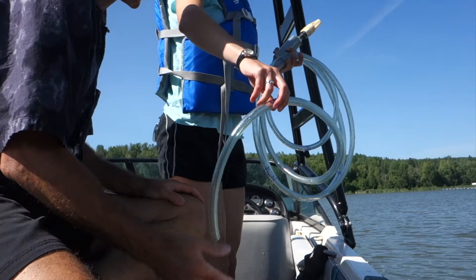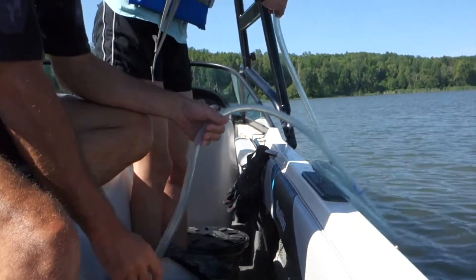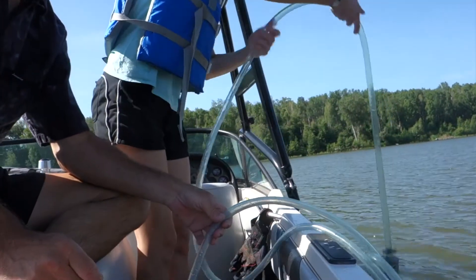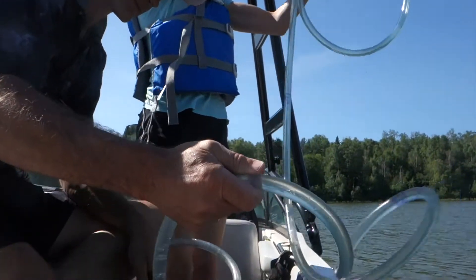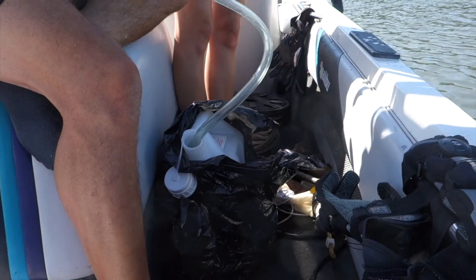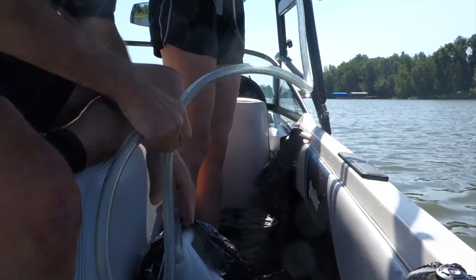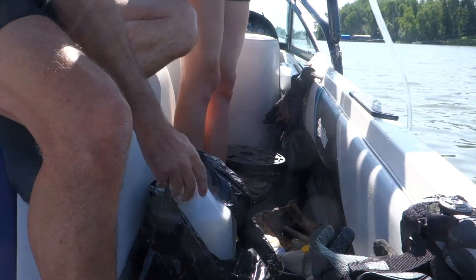With your assistance, your technician will collect the appropriate amount of water samples depending on the secchi depth that you measured earlier. After you've collected everything, cover up your container and secure your equipment in a safe spot on the boat. Now you're ready to do it all over for the next 9 sites.